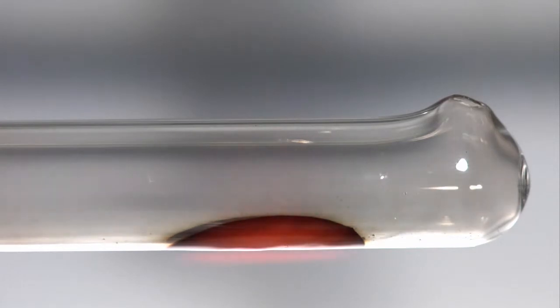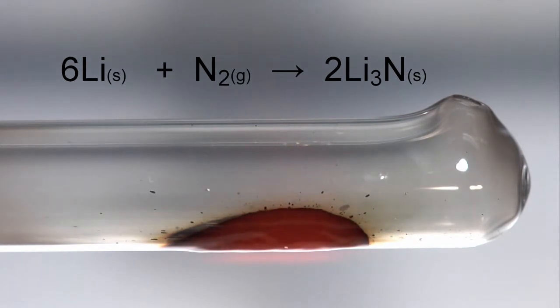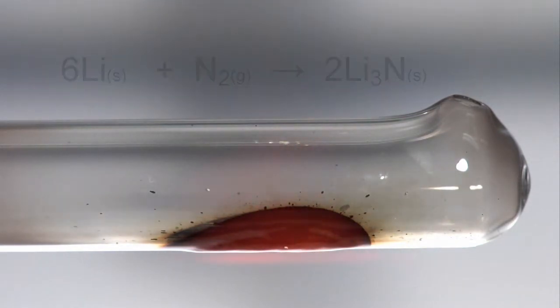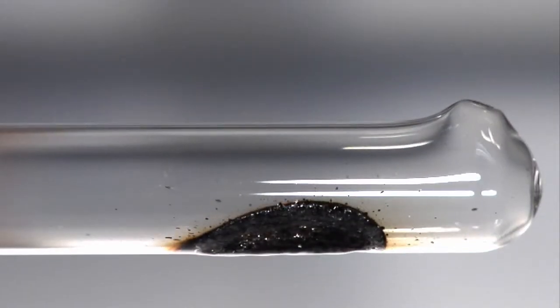The lithium reacts with nitrogen, forming lithium nitride. The lithium nitride is intensely coloured, dark purple, almost black.